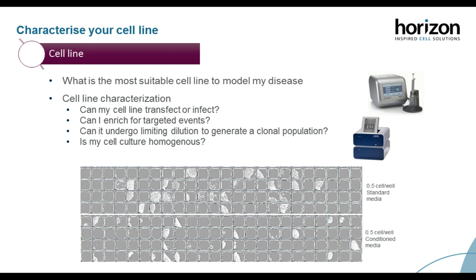What you can see and appreciate here is that I am getting better recovery and better cell outgrowth when I use the standard media. This is just to highlight that the conditioned media isn't always the best way forward, and that sometimes doing this test can be extremely informative, because I have had cell lines not grow at all in their standard media or not grow at all in the conditioned media. It really is cell line dependent. So it's really good to do this test so you're not ending up with absolutely no clonal populations or outgrowth on your 96-well or 384-well plates.